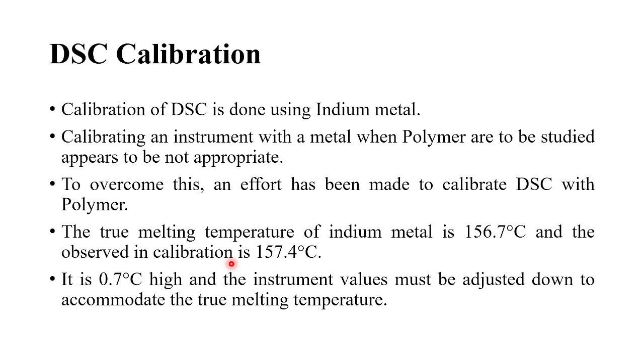So before sample study, we first calibrate the DSC instrument. How can one calibrate it? Calibration of DSC is done using indium metal, since it has a very specific melting point. Calibration of an instrument with a metal when polymers are to be studied appears to be not appropriate.